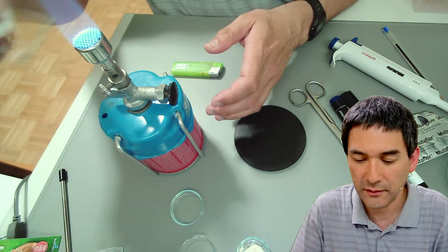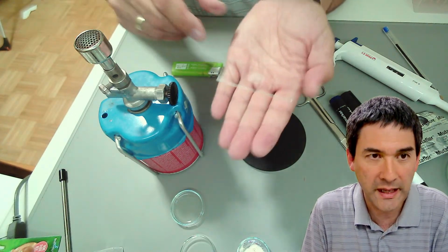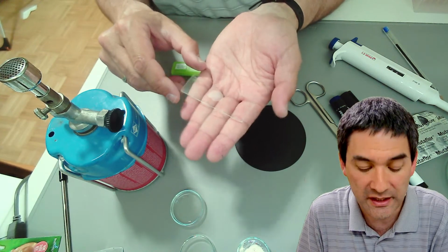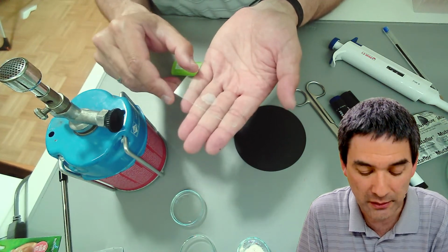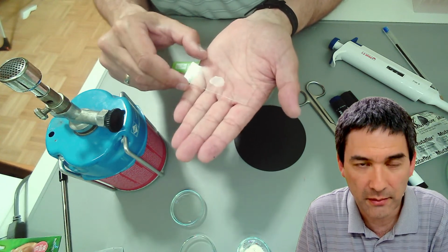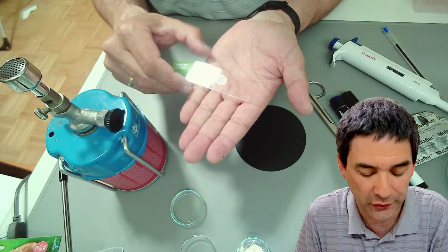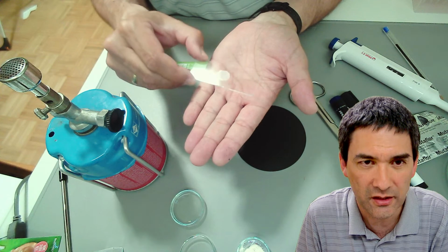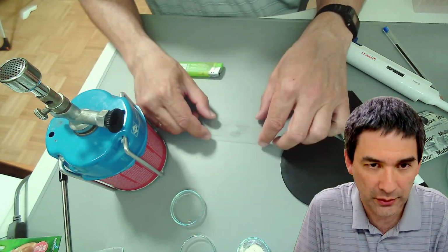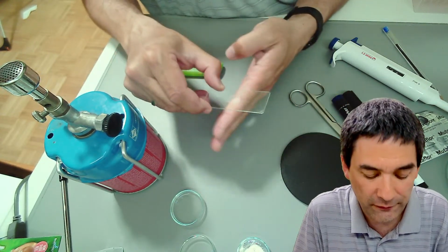1, 2. I turn it off, and when I hold it on my hand like this, I should be barely able to hold it. It's pretty hot, but it doesn't burn me. Okay, that's then the correct amount. It's quite hot, but not hot enough to actually burn. It does hurt. So let's cool it off a little bit. I'm going to put it on here to cool it off. And now it's heat fixed.